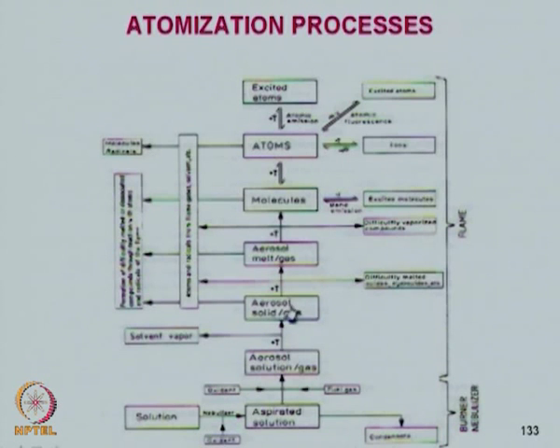At this stage the real chemistry starts. Sometimes oxides, hydroxides etc. are formed in the flame. These are difficult to melt, they have high melting points basically.